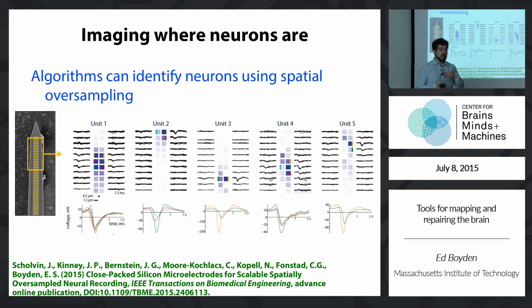We're trying to use electrodes to act more like cameras and image, and then as I showed you earlier, to use cameras more like electrodes, not to obtain images, but to obtain temporal activity, right? Blurring the lines between electrical and optical recordings. So anyway, once we've sorted the neurons out, we can then try to estimate the probability of an error. Given that a spike was from one of these pads, and with this particular pad distribution, of course, what's the probability that it came from this neuron? And of course, that's very, very small.